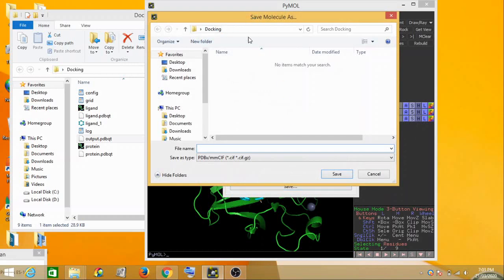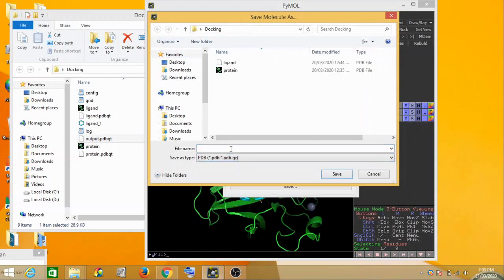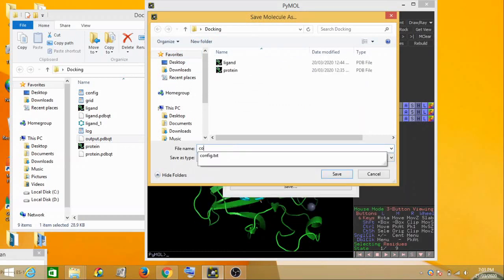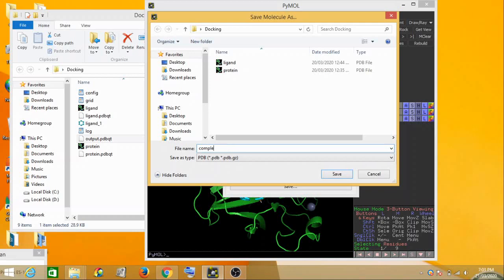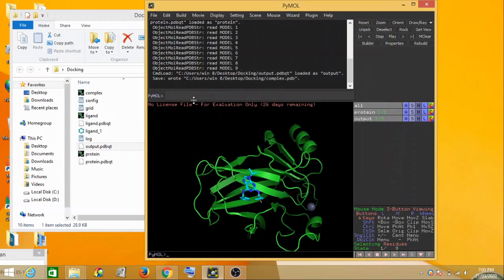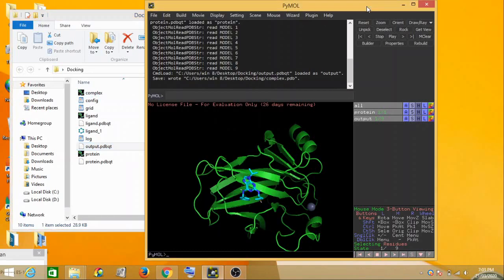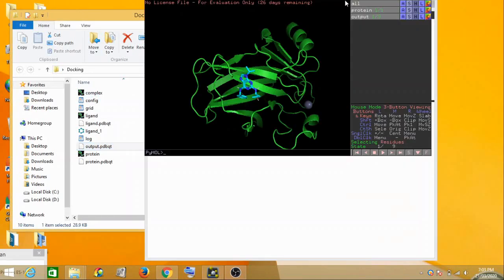You have to save it to whichever folder you want. So this is the docking folder which I had created earlier. I can save it as complex because it's a protein-ligand complex, and then I can select save. So we have the protein-ligand complex being saved here.